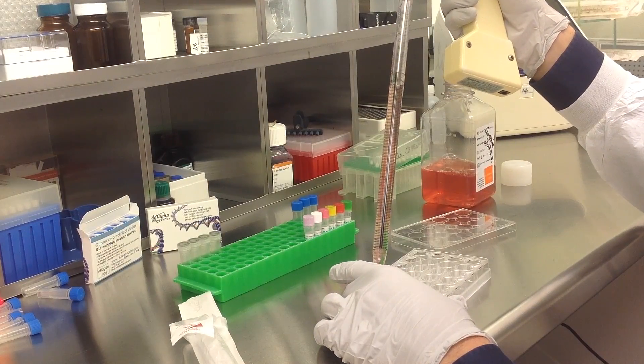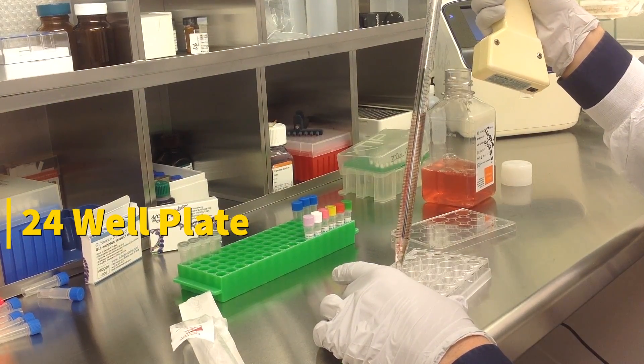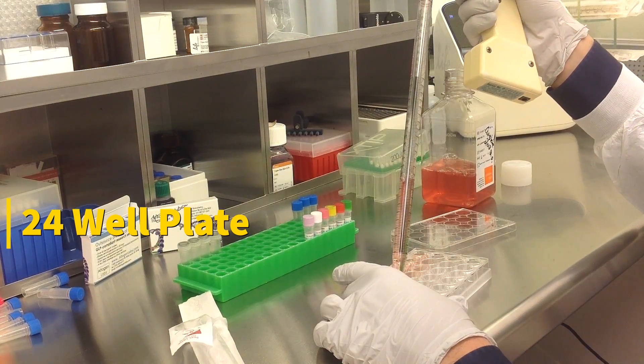Today we will be transfecting A431 cells obtained from ATCC. We will be using a transfection kit manufactured by Altogen Biosystems. In this tutorial, we use a 24-well plate. Transfections can be scaled up or down based on plate surface area as described in the corresponding transfection protocol, which can be found at altogen.com.